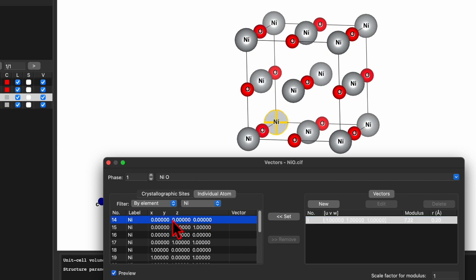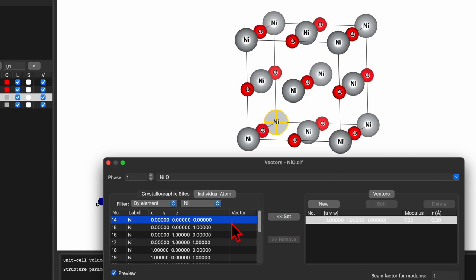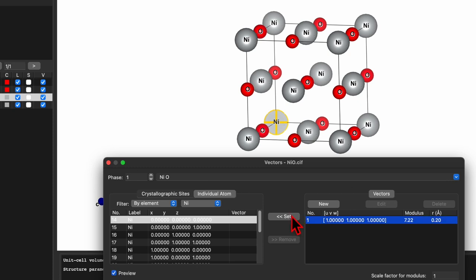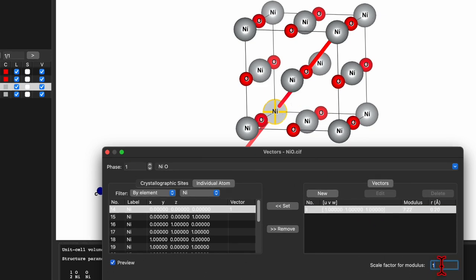Now select the atom — this atom has XYZ of 0 0 0 and is located here in the unit cell. Select another atom to see its position. For this atom, assign the vector: select the atom, select the vector, and click Set. The length of the vector is too long, so change the scale factor for modulus — let's set it to 0.12.